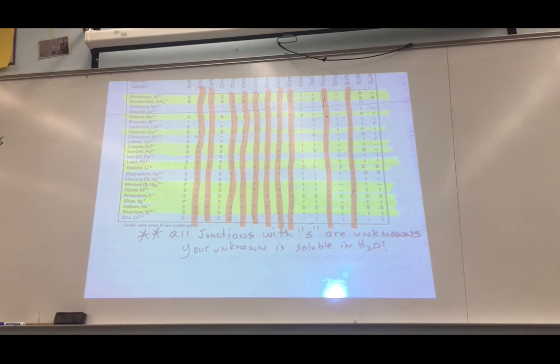Are you gonna have the same amount with the test tube? Yes. There's the same amount in each test tube. How many do you use? It holds about, I think a 13 millimeter test tube holds about 10 milliliters. All right, on Monday, I'll go back over this and I will run a sample unknown for you so you have an idea of what it is we're doing. All right? Any other questions?